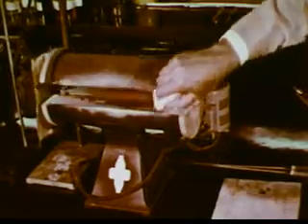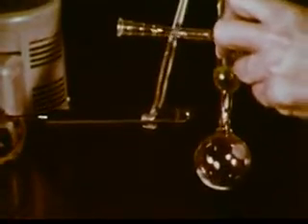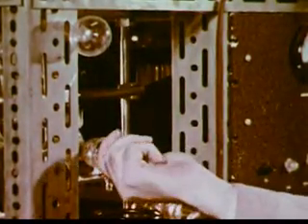The quartz tube is heated and drawn down. After the air in it has been pumped out and the tube sealed, it is placed in a furnace at 1100 degrees centigrade. At this temperature, the ester decomposes into carbon monoxide and other products, including carbon. As the tube is removed, we can see the black carbon. The carbon monoxide can be transferred into this flask and then into the mass spectrometer for reading.